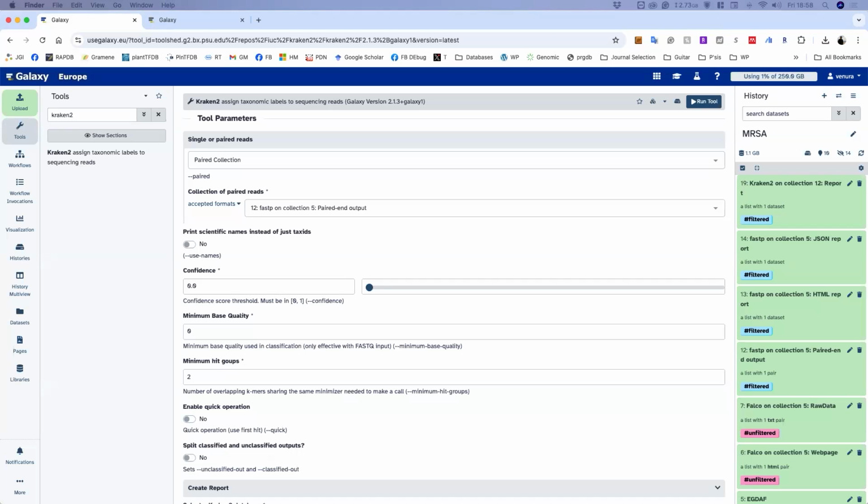Excuse me, sir. It's also when we consider two of the same species but different individuals. It's like population genomics. Yes. When we go to the sequencing project, if there are more than one individual, we can get a bunch of all the genome sequencing details. So how can we divide the report for this individual and this individual? That was the question.